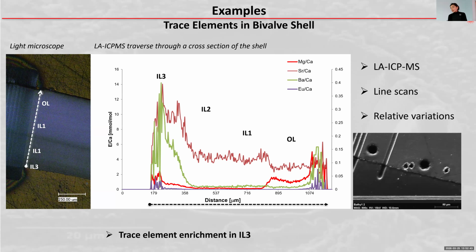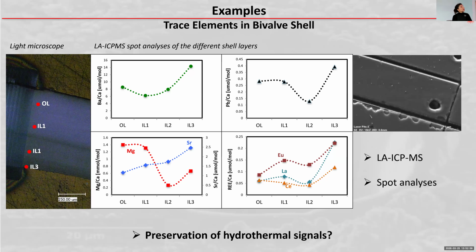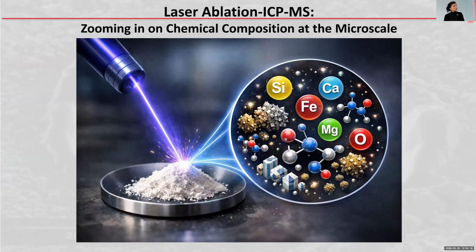And then we used the laser, and the laser really revealed that it is a very weird layer. It's not even calcite. So we did trust in the Raman spectroscopy. We did some more resolution, like spot analysis, high resolution, and are working on that. What modification of calcium carbonate is it that has these weird partition coefficients? So I thought this is a very nice demonstration of how probe, SEM and structural spectroscopy methods can work together and reveal really cool things for the characterization.